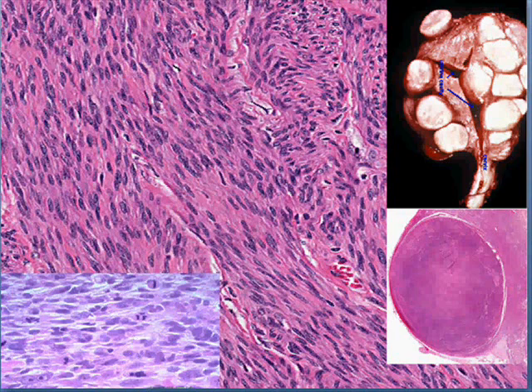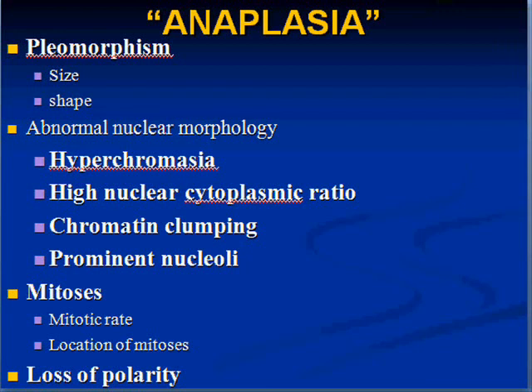Let's talk about the concept of anaplasia now, as long as we open the doors. We talk about anaplasia as being synonymous with malignancy. The anaplastic features of tumors microscopically have several common features, which I just want to show you quickly, and we'll talk about them in the next group.